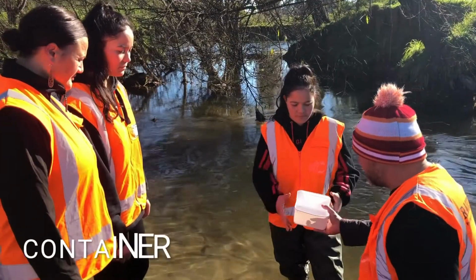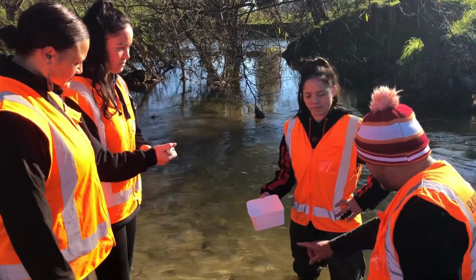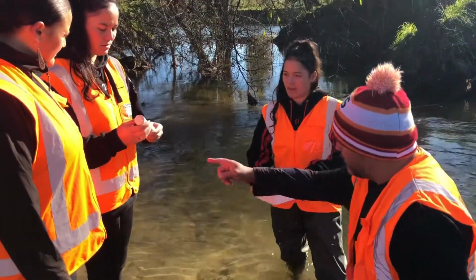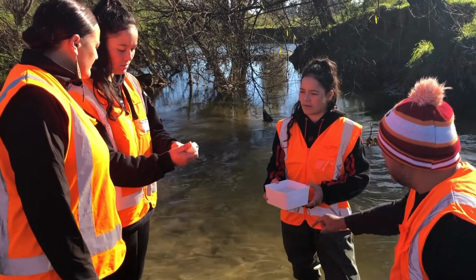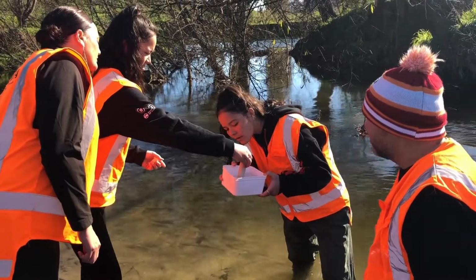Alright girls, here's an ice cream container, our probe, let's get stuck into it. So how high should I fill this up to? If you fill it up about halfway, it should be plenty. And how does this work? If you take the cap off, turn it on and zero it, make sure it's at 0, then we just hold that probe in the water until it stabilises.